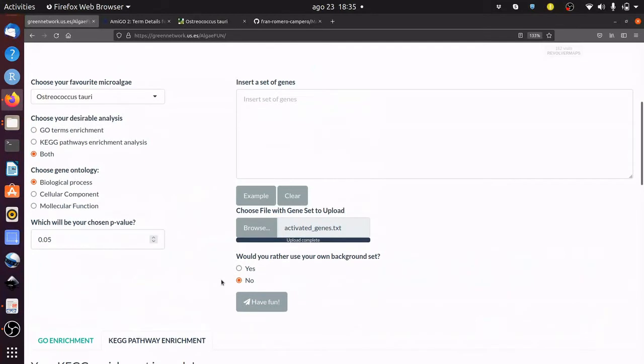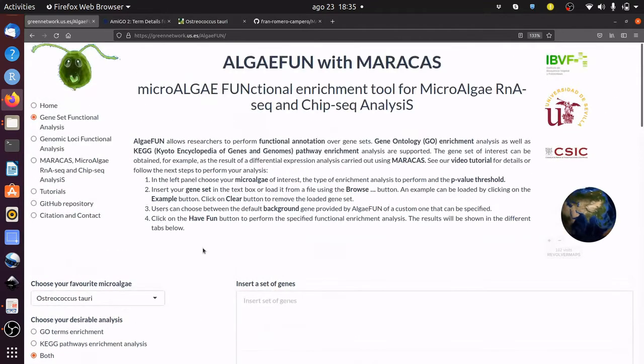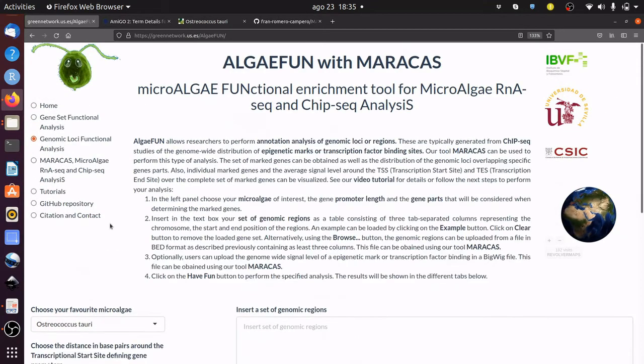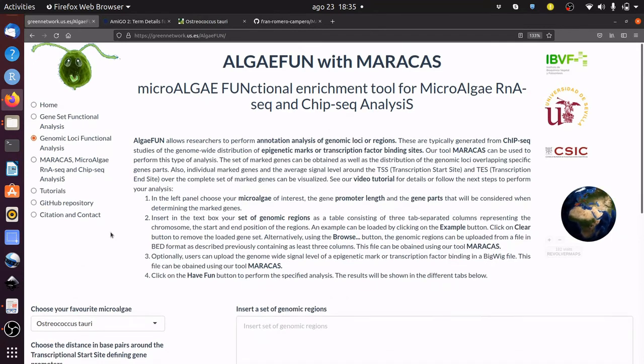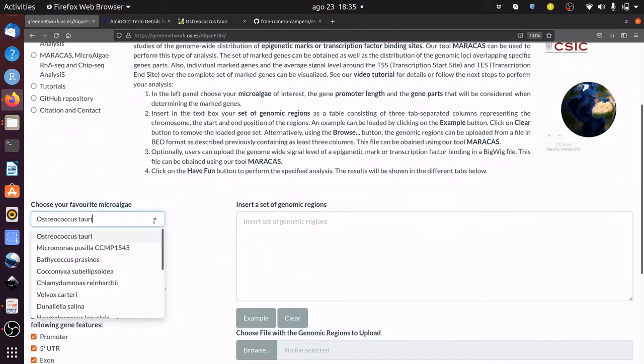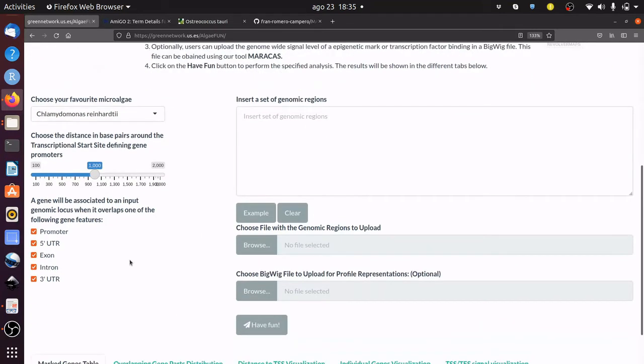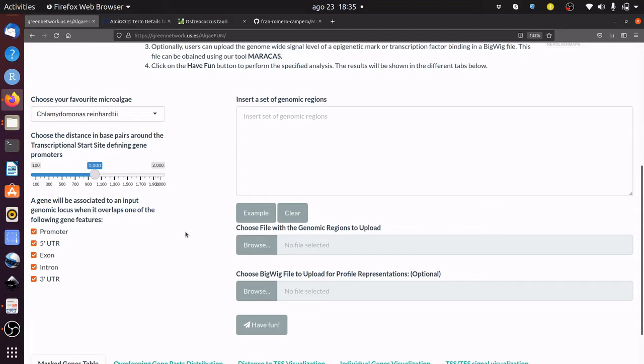AlgaeFan also supports the functional analysis of genomic loci and mapping signal generated from ChIP-seq data. After choosing your microalgae of interest—Chlamidomonas reinhardtii here—you need to specify the gene promoter length and the gene features to consider in the process of identifying gene targets associated with the input genomic positions, or genomic loci occupied by your transcription factor or histone modification. This data can be inputted in this text box or uploaded using this button.